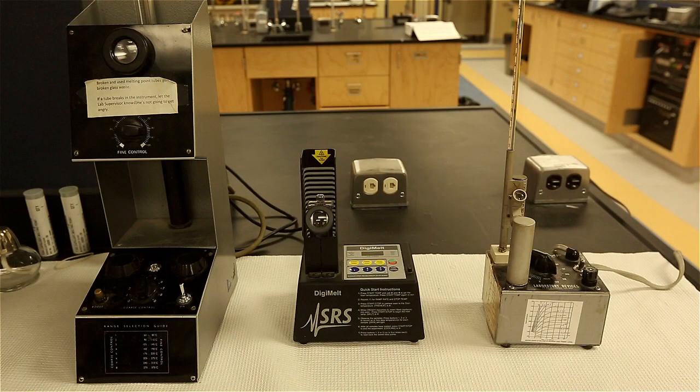The melting point is the temperature at which the solid and liquid phases of a compound are at equilibrium with each other. Once the melting point has been reached, the temperature of the compound will remain constant until the entire solid has been converted to the liquid state.